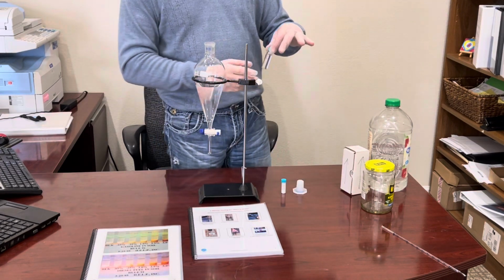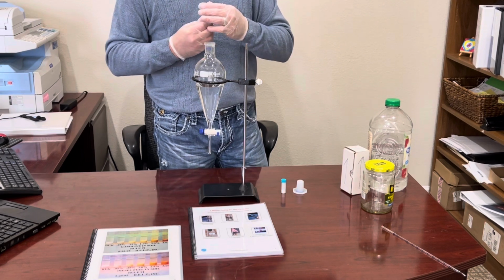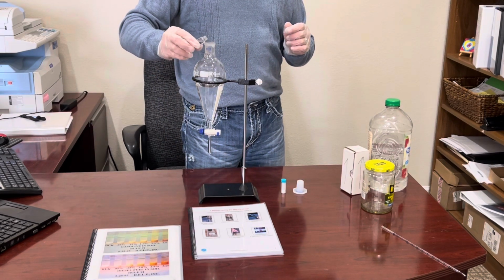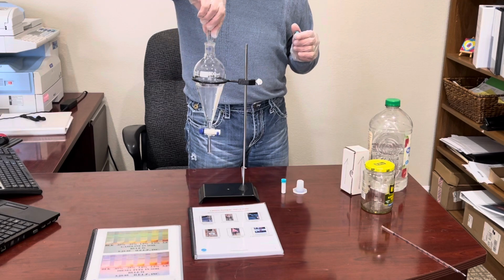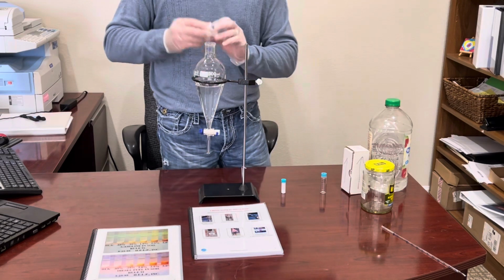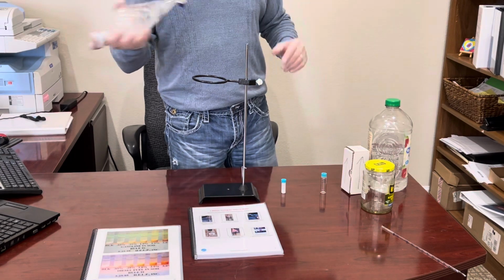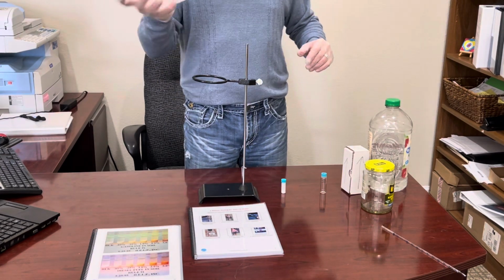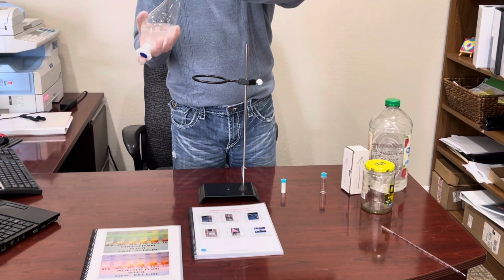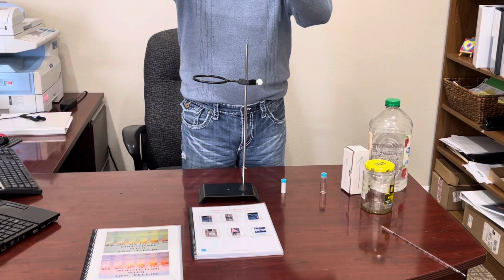And now, instead of using our typical heavier water extract solvent, we're going to use our lighter high range extract solvent that's actually lighter than water, but it will do the same thing. It will do the extraction. We will just have to add that additional step of getting rid of the water sample prior to releasing the extract solvent into our test tube. So we're agitating our water sample to do the extraction, moving that extract solvent throughout the water sample.